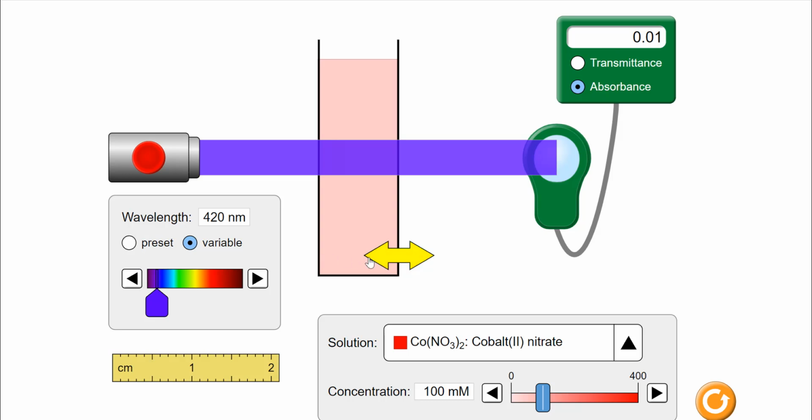That's part one. Part two, once you figure out the special wavelength for each chemical, every chemical will have its own, we call that a lambda max, the lambda where the absorbance is the highest, that gives you the strongest signal. We're going to track down how your absorbance changes versus your concentration. So I'm going to start off with, let's say, 0 concentration. I'm going to go upwards.